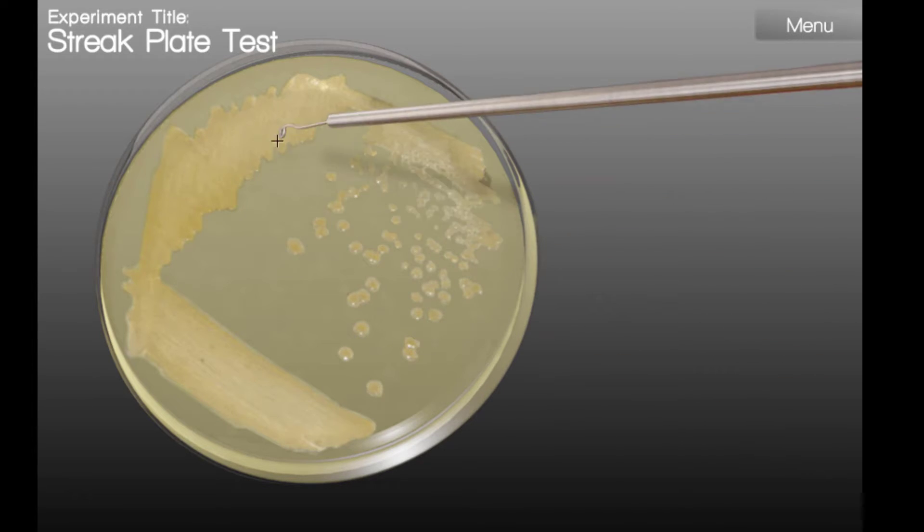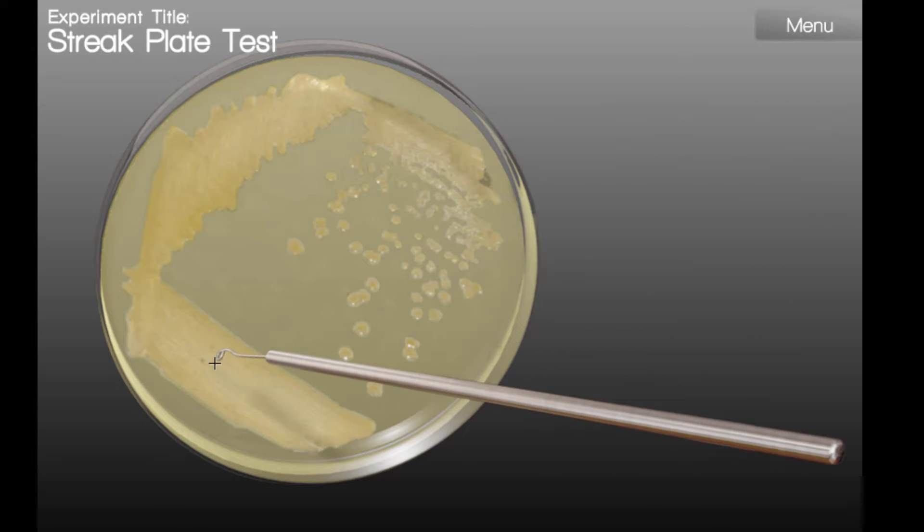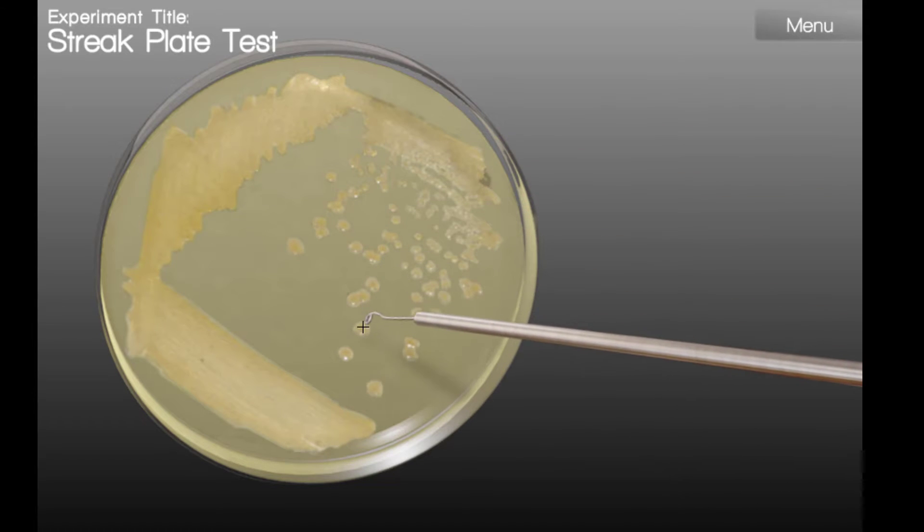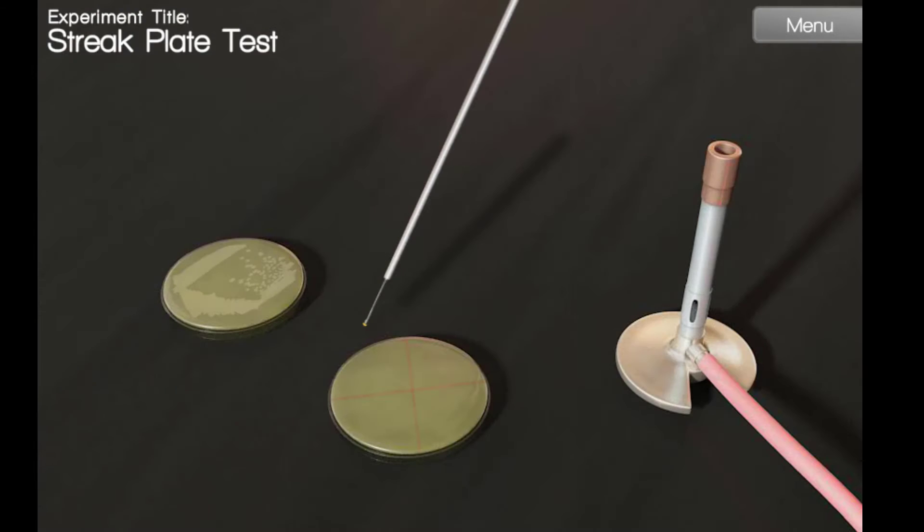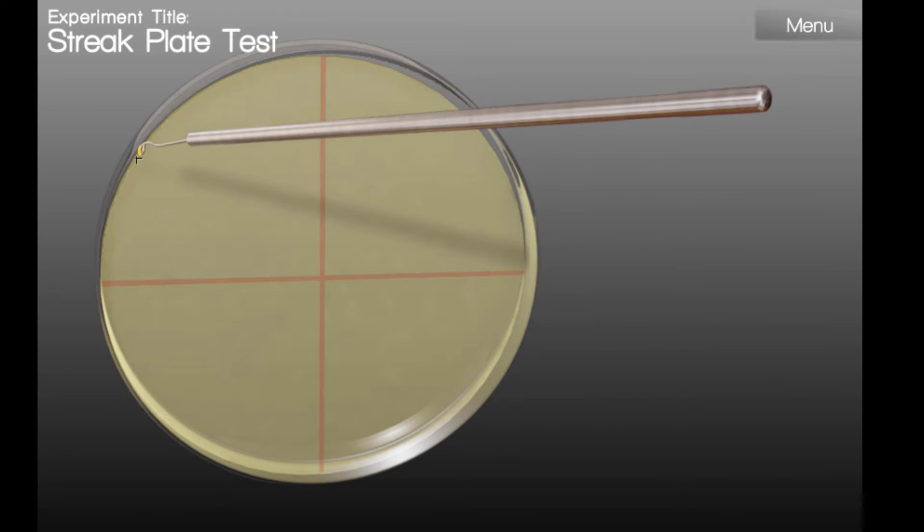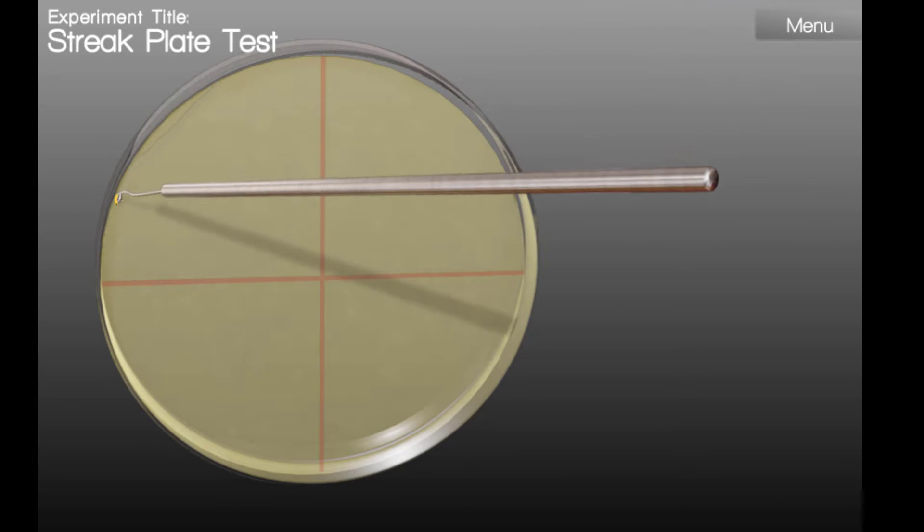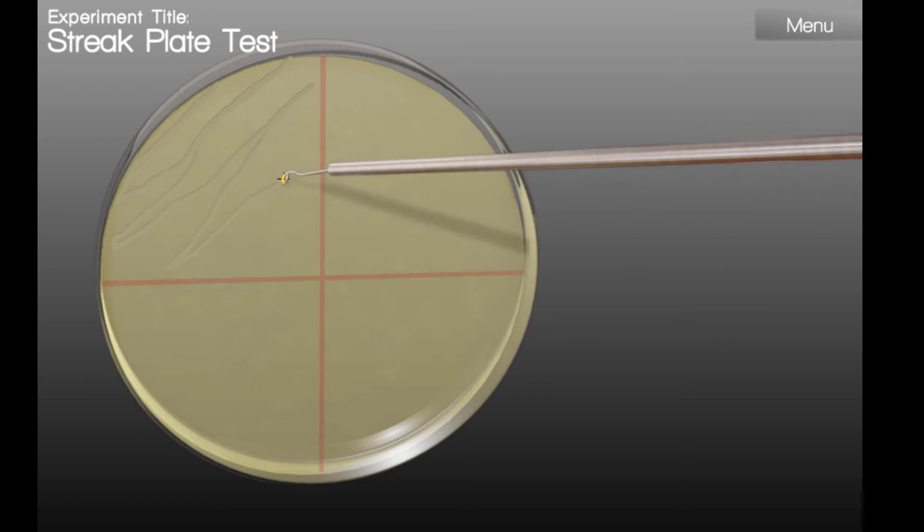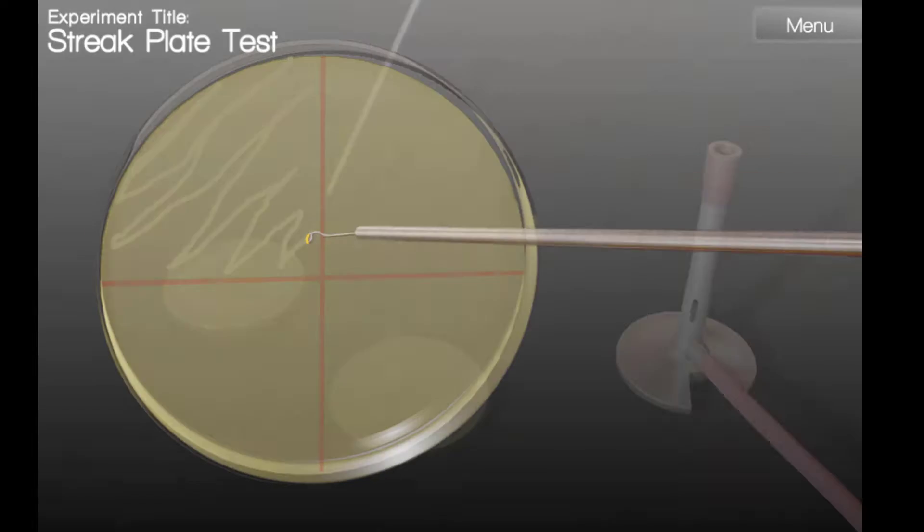You want to avoid areas that look like this or this. I think this looks like a nice colony. Now that I have picked my colony, I'm ready to streak the first quadrant of the plate. When streaking the first quadrant, you'll want to make sweeping motions going back and forth, but you'll want to make sure that you stay within that first quadrant.